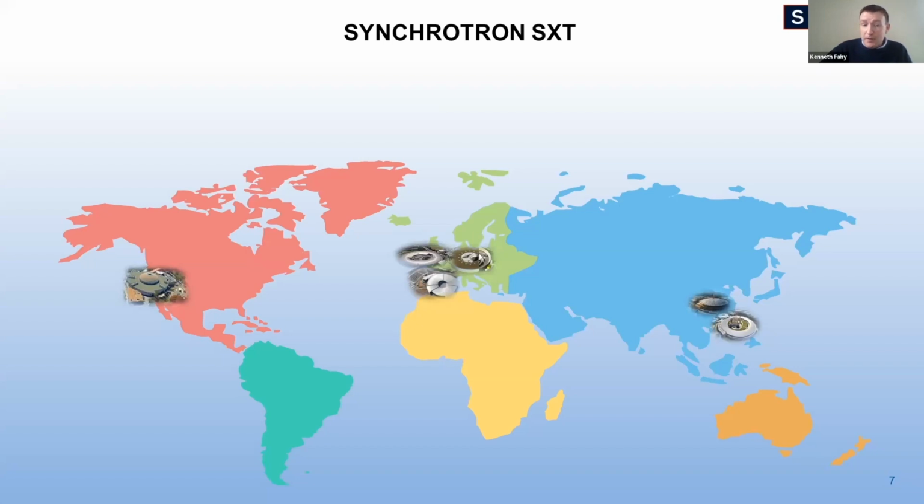The benefits of a laboratory-based soft X-ray microscope will be on-demand access, as well as a greater scope for development of dedicated correlative workflow techniques that might benefit from soft X-ray capabilities.